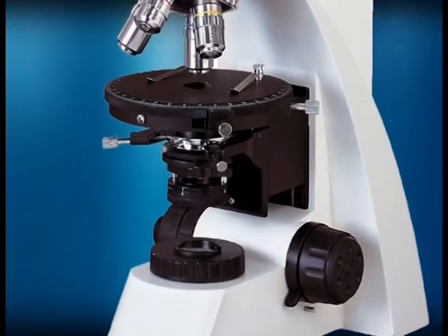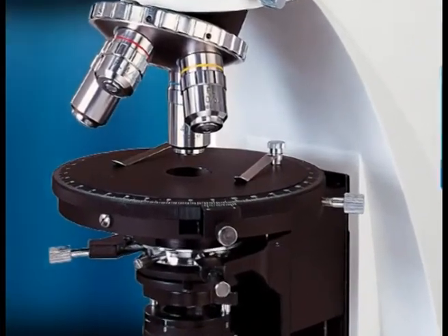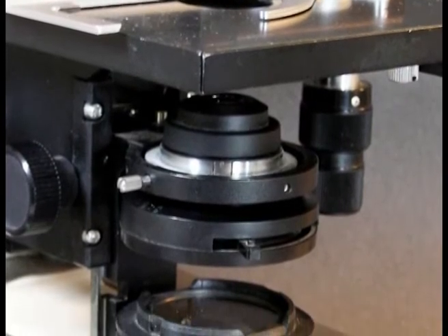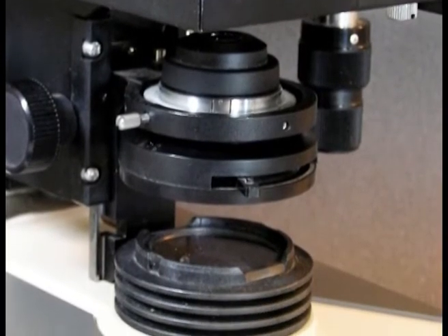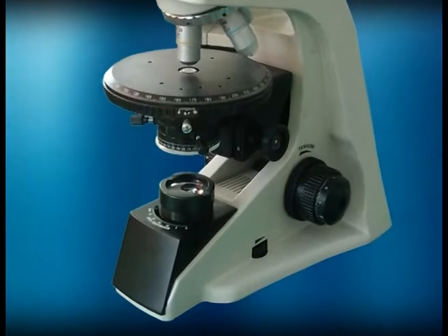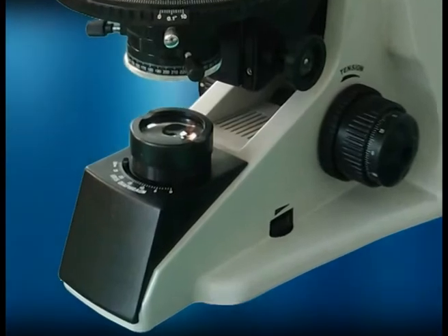The amount of rotation of the stage can be read off directly from the graduations marked on the stage, aided by the vernier. A small knob is provided at the rim of the stage and it allows the stage to be clamped in any position. The sub-stage apparatus is below the revolving stage and consists of the lower Nicol or polarizer, an iris diaphragm, and a condenser. The sub-stage apparatus can normally be swung out of the light path or be completely removed by lowering it to its minimum position.